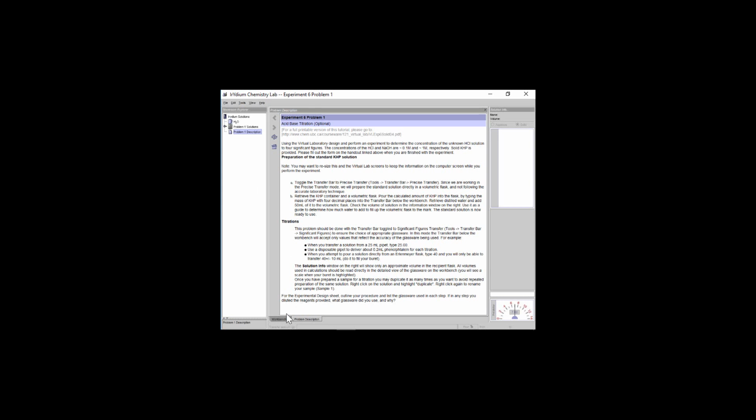So if I go back to my workbench here, my lab environment, just like in a wet lab, you can pull out a whole host of different glassware. So I'm going to first make my standard solution here. Maybe I'll need a beaker. I'll even pull out a volumetric flask. Pull out a 100 ml volumetric flask here. Beakers are really good carrying tools. You can start measuring masses in beakers, but unfortunately the markings on the beaker here are not very precise.